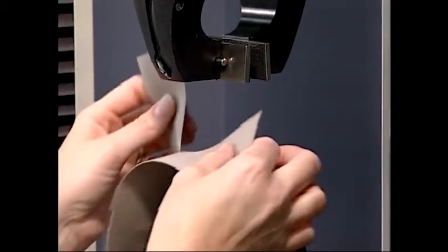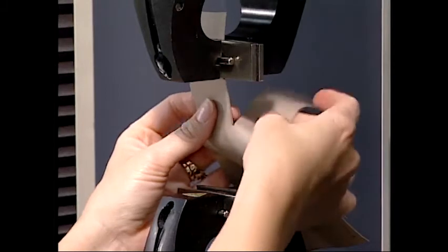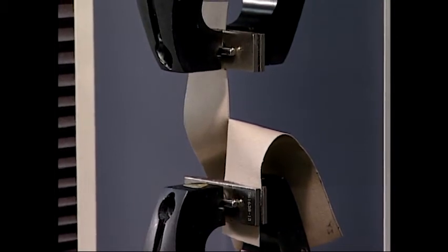During testing, one tongue of the specimen is gripped in the upper jaw of a tensile testing machine, and the other tongue is gripped in the lower jaw. The jaws are separated continuously to apply a force to propagate the tear across the specimen.